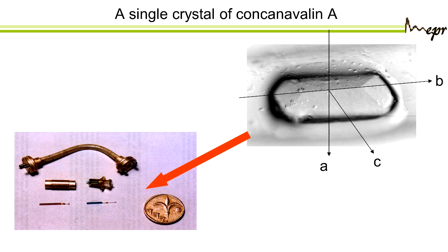So now you see here, at the bottom you see the tubes. They are just filled with a solution of metalloproteins that have color, and so you can see. Then above it you have the cavity, a cylindrical cavity for W-band, and it has slits, and the RF coils come above and below. And then you have this on the right. That's where you insert your sample, and that's where it goes into the cavity.